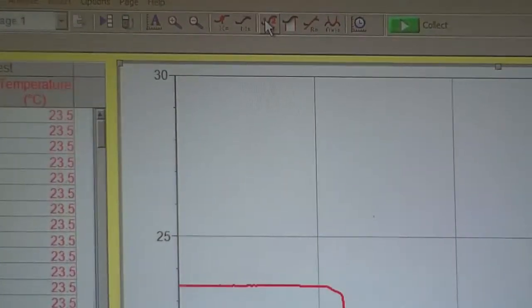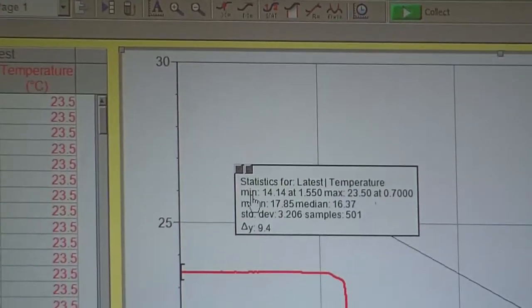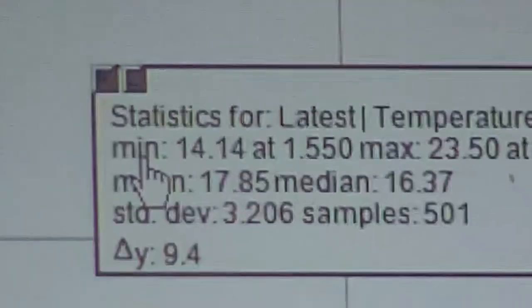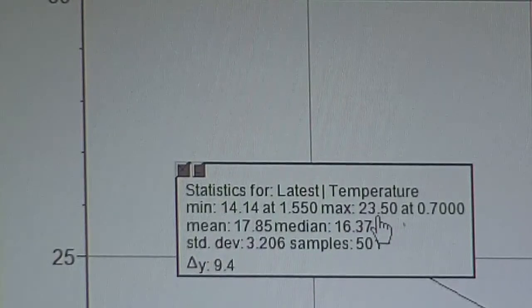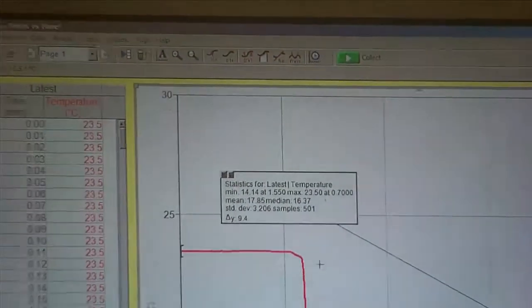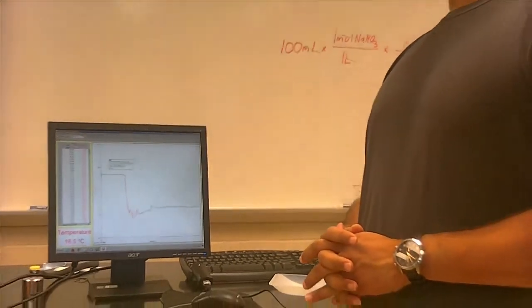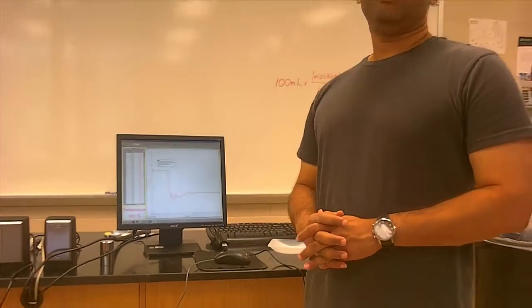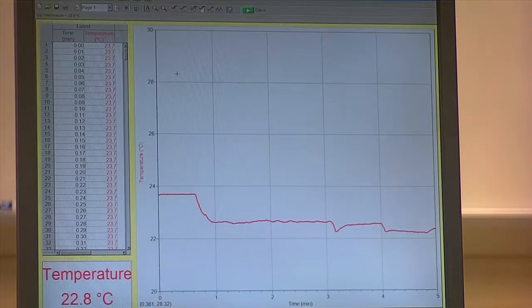Click on the stat button. From the stat button you will be able to determine your minimum temperature and your maximum temperature. Do this a second time and get another minimum temperature, and then you're ready to do the data analysis.